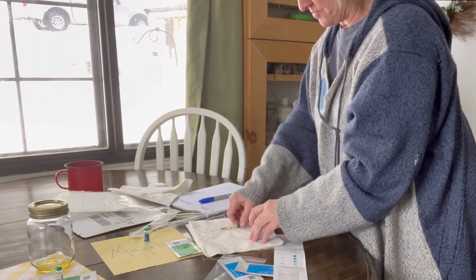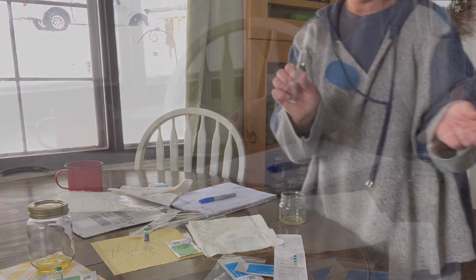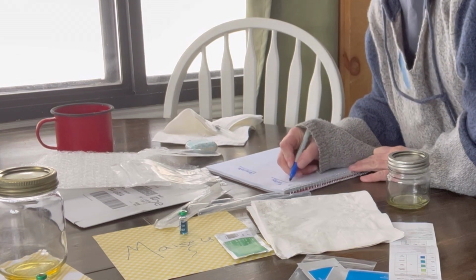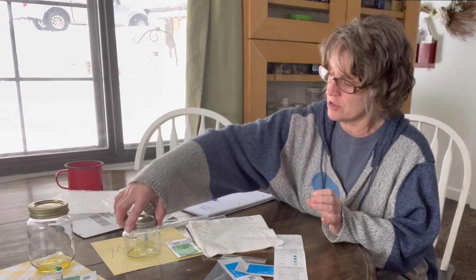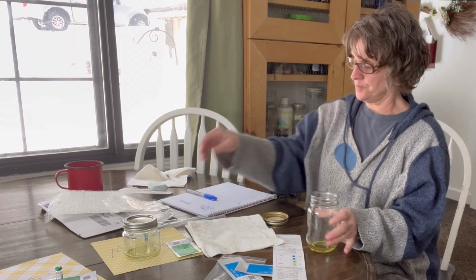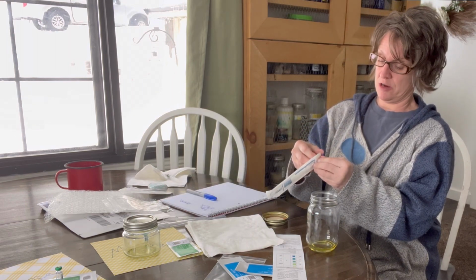All right. So now I'm going to put the lid back on and note the time, 12:15. Okay, we have to wait 10 minutes, so I've documented the time for Macy's. I'm going to cover hers back up, and now I'm going to do Penelope. We'll see what is going to happen here.